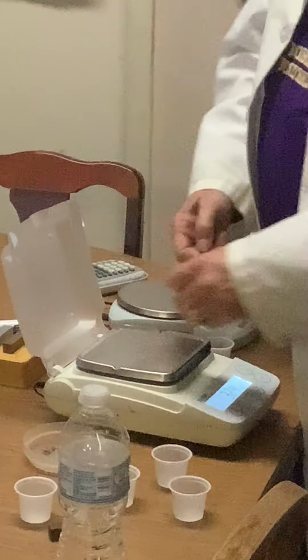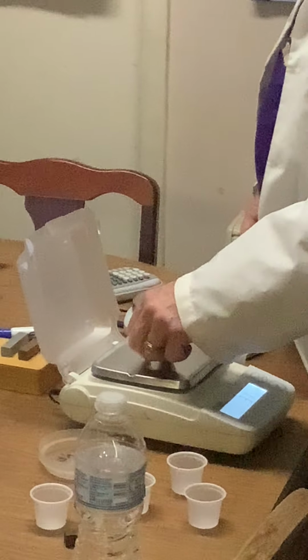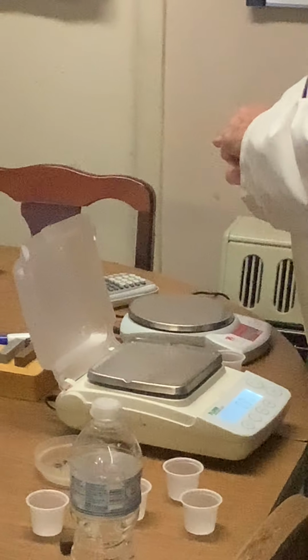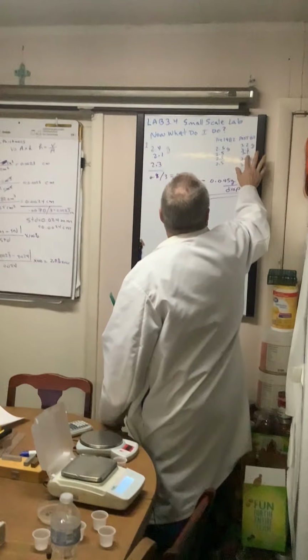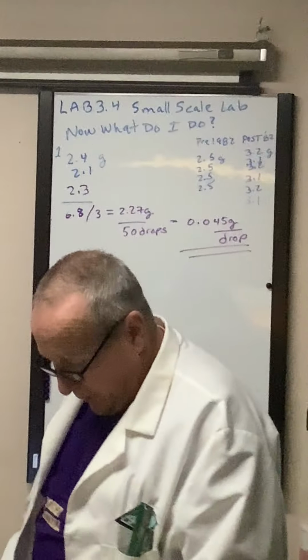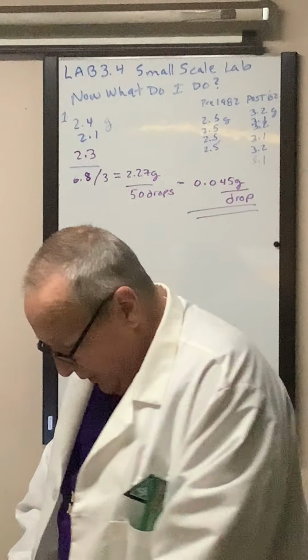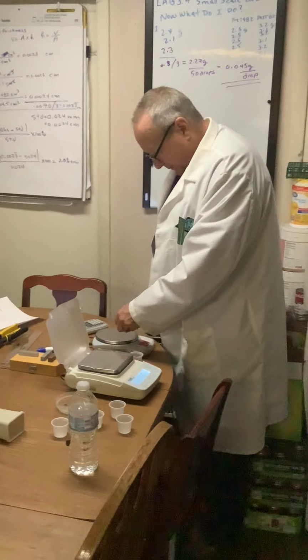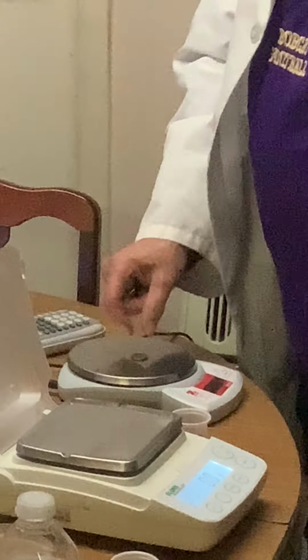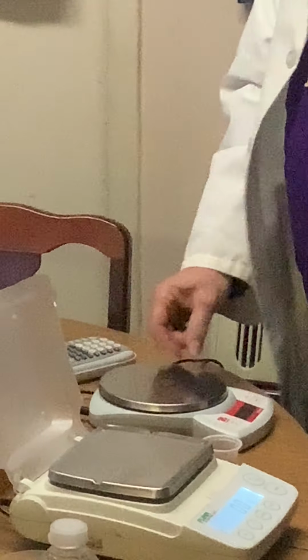3.1 and 3.1. So, when I did it before, every other one was weighing 3.2. I might have been using a different balance. 3.0, 3.1, 3.2. So this balance might be calibrated a little differently, 3.2.